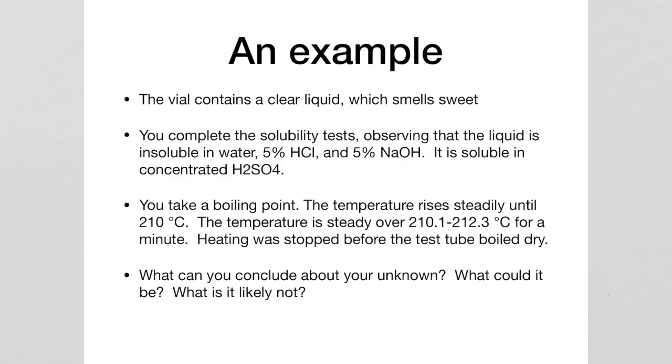Okay, now I want to walk you through an example of how this will work. When you get to the lab on Tuesday, you're going to have 2 glass vials in your hood. They're going to be stoppered with corks. And one of them will have a liquid in it and one of them will have a solid in it. And your goal at the end of the 3-week period will be to have identified both of these compounds.